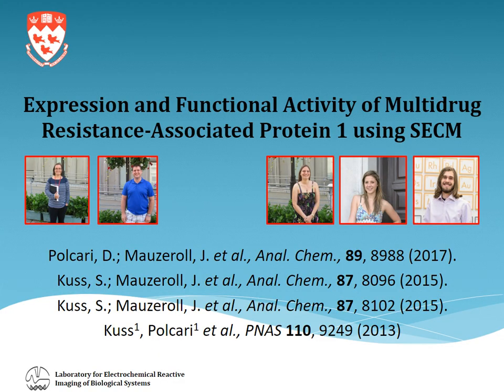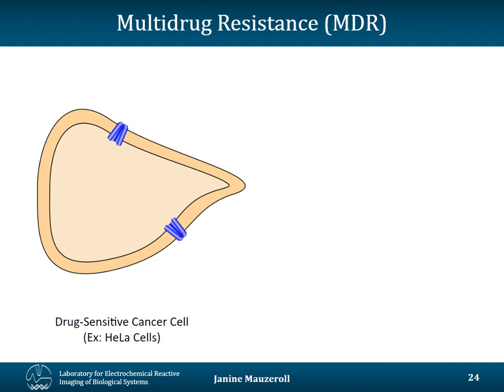So in our group, one thing that really interested us was to use SECM to monitor the flux of species coming from cancer cells. Now, on the left-hand side, you have a normal cell. In this case, for this work, we were using HeLa cells. And on the cell membrane of all cells, you have transmembrane proteins that are there to detoxify your body, highlighted in purple.